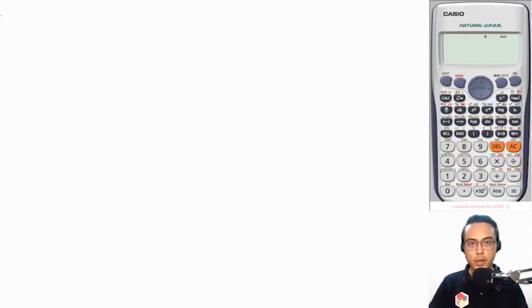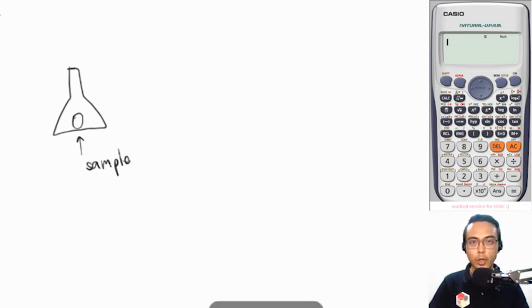In the Dumas method, your volatile sample is placed in an Erlenmeyer flask, which is sealed by an aluminum foil with a little hole at the middle. The purpose of the hole is that as we heat the flask and your sample vaporizes, some of the excess vapor of the sample would escape from the hole.